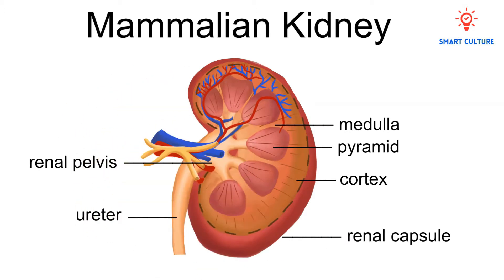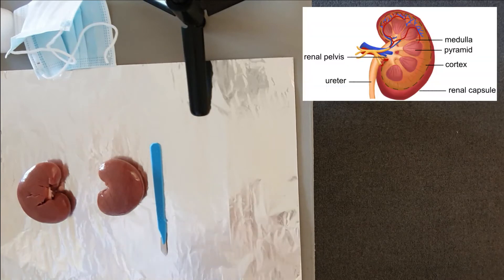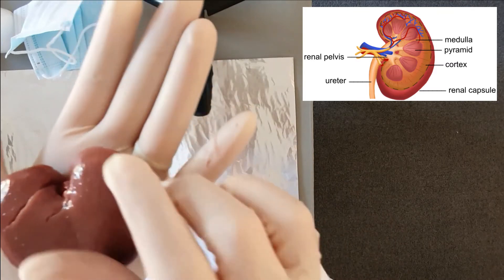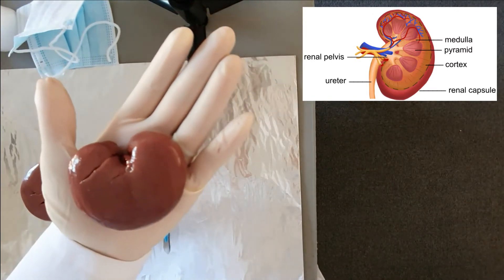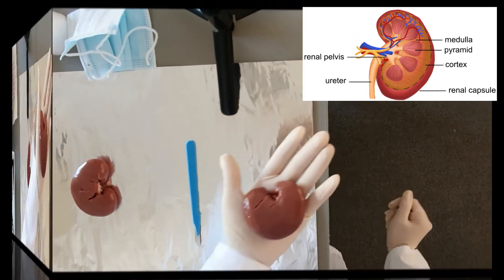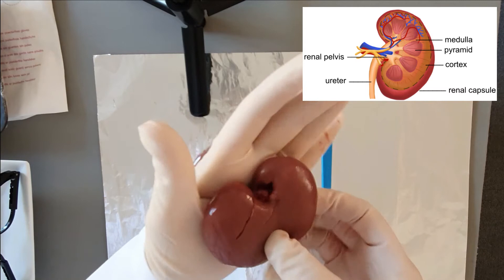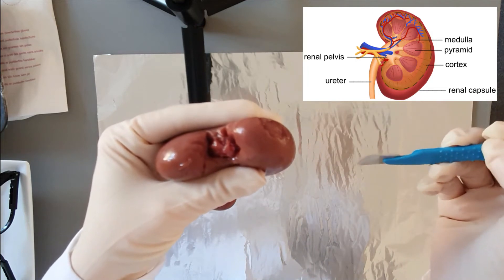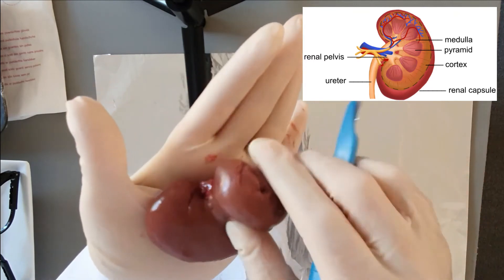Let's move on to the dissection of the mammalian kidney. This is the kidney of a sheep. Sheep have two kidneys — they are bean-shaped organs that play a major role in the processes of excretion and osmoregulation. The renal capsule has already been removed. The renal capsule is a tough semi-transparent membrane that covers the outer surface of the kidney. The rounded side of the kidney is referred to as the convex side, and the indentation on the concave side is called the hilus.